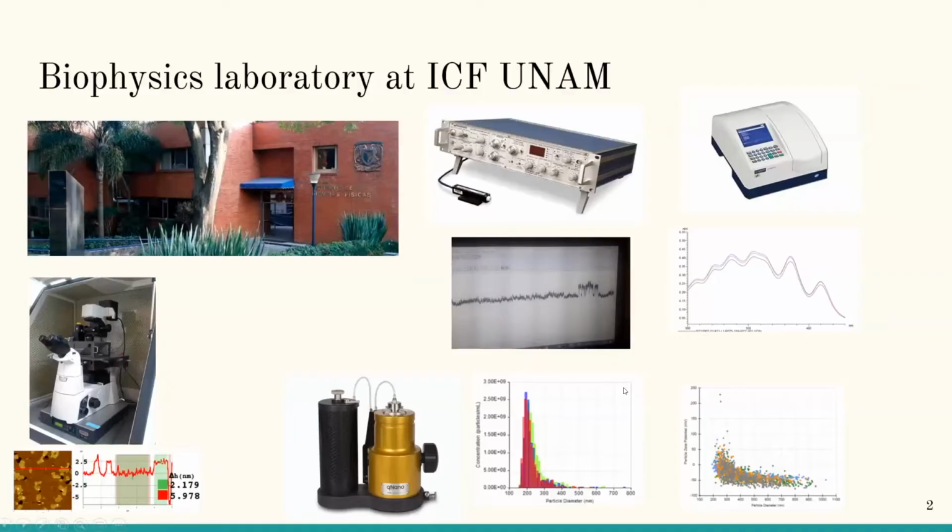As Armando said, we are at the biophysics lab at the Instituto de Ciencias Físicas in Mexico, UNAM. This is the institute. At our lab, we have different techniques. We are always studying the systems with various different techniques. We have electrophysiology equipment to measure single channel activity. We have UV specs to analyze aggregation and dimerization of our particles. We use, of course, the XeBio AFM from Park Systems to do topographic imaging and mechanical properties, and we also have tunable resistive pulse sensing for analyzing particle size and zeta potential distributions.